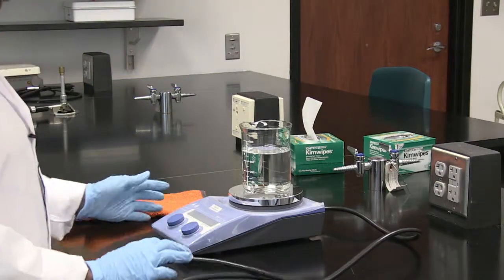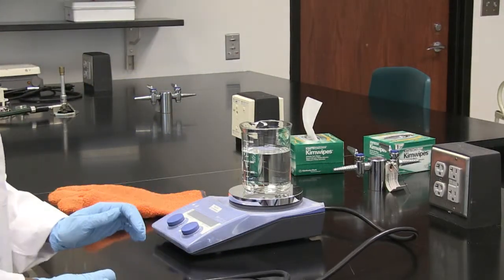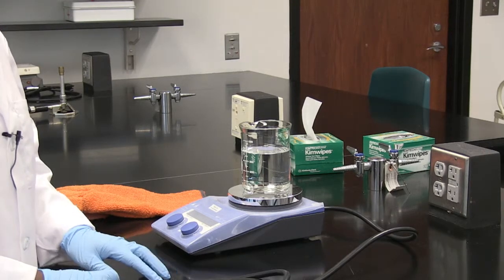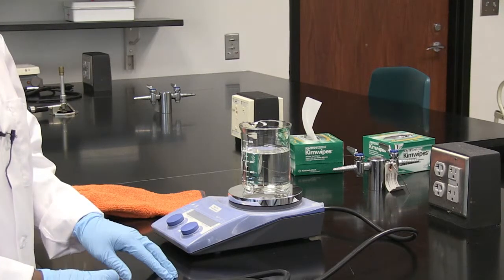When handling the equipment, make sure you follow your instructor's guidelines. Only turn on the equipment when the instructor tells you to do so.